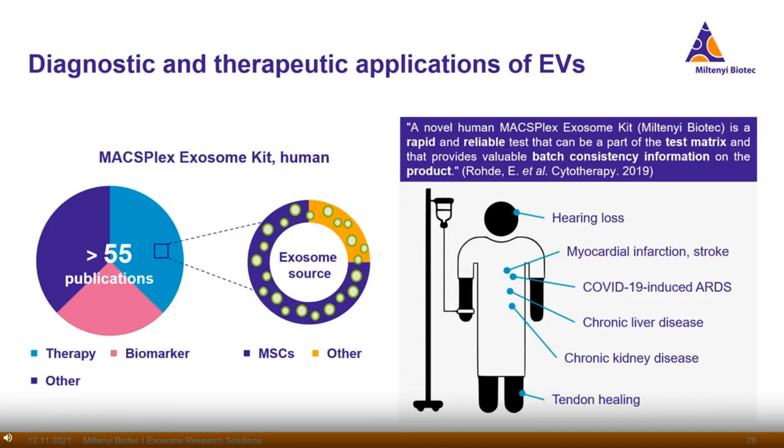I hope these experiments could give a glimpse of the potential the multiplex bead-based EV assay holds. However, many more studies are published employing the assay to investigate the biology of EVs and to explore their potential in clinical applications. And one application I would like to highlight here at the end is the use of the assay to characterize and assess the quality of EVs for clinical use.